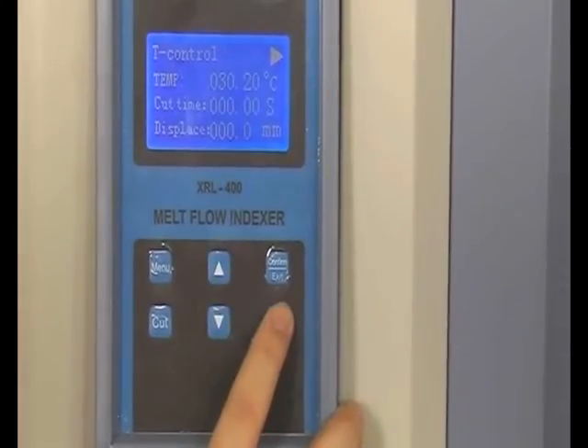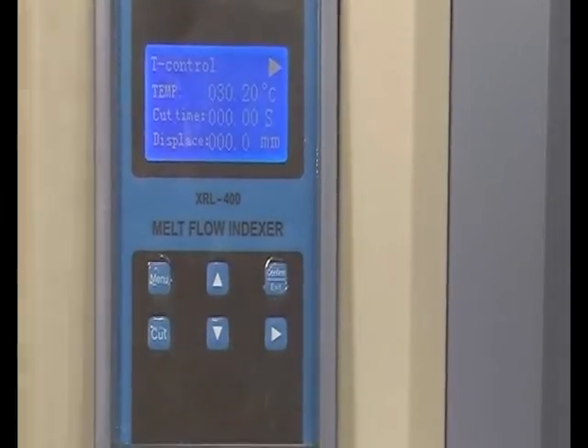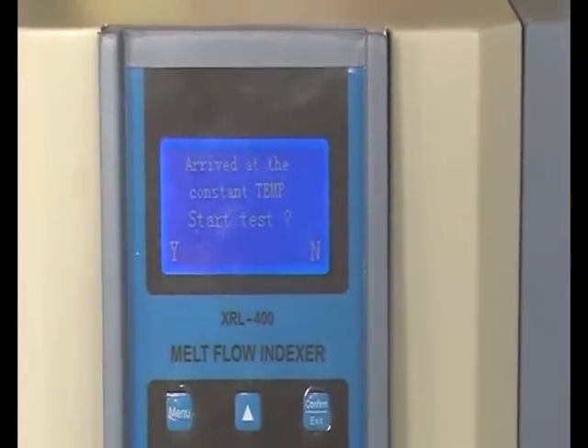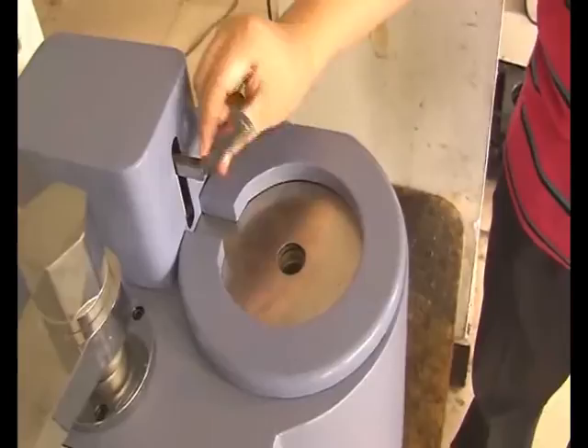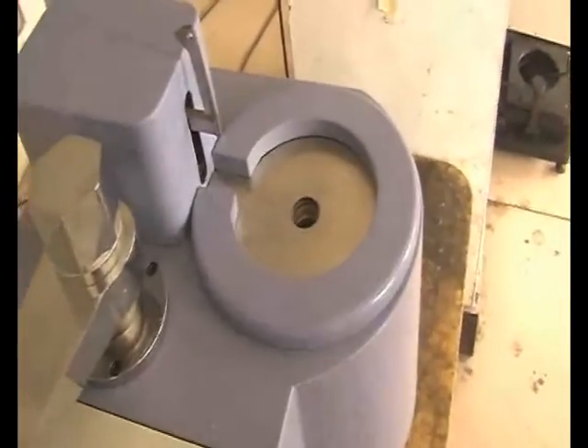Now this right button is for running the test — press it. You can see there is a signal on the upper right of the screen. It means the temperature is being increased. When the temperature reaches the constant position, we have to put the material into the charging barrel.